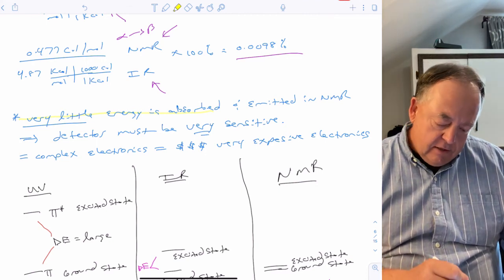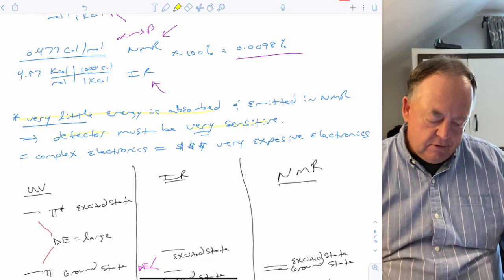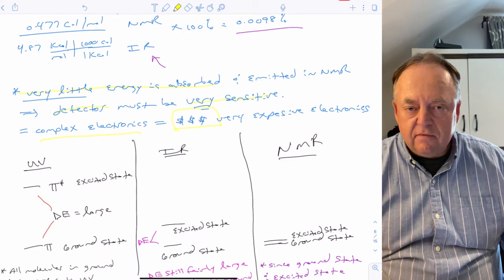Basically what that means is you need a very sensitive detector to measure those small energy changes. So what does that mean? That means it's very complex electronics involved, and that means it's a very expensive instrument.